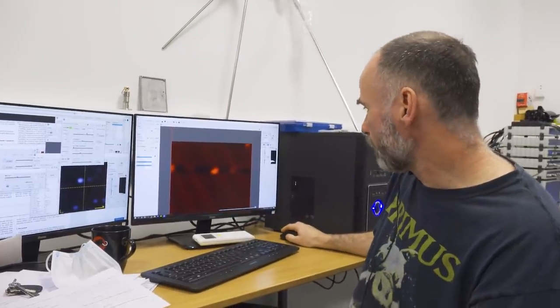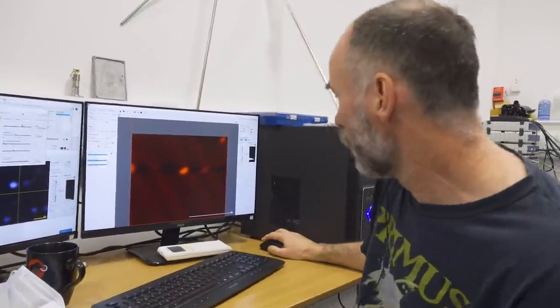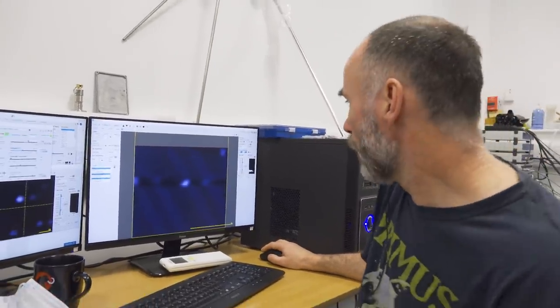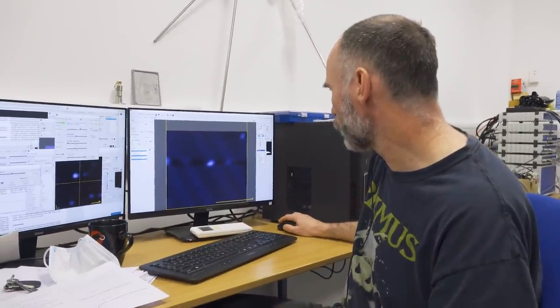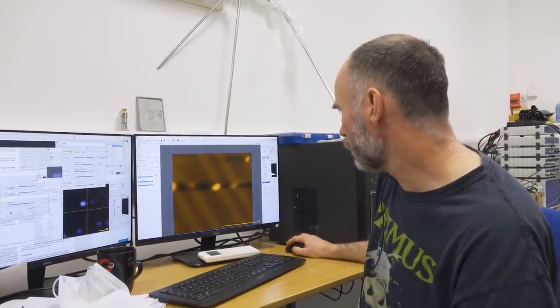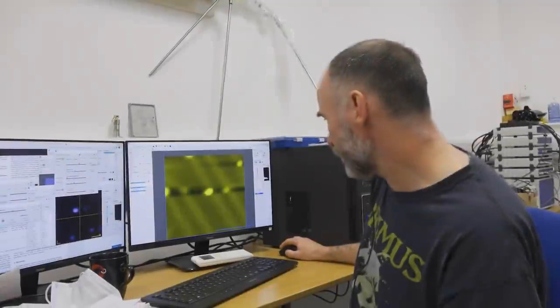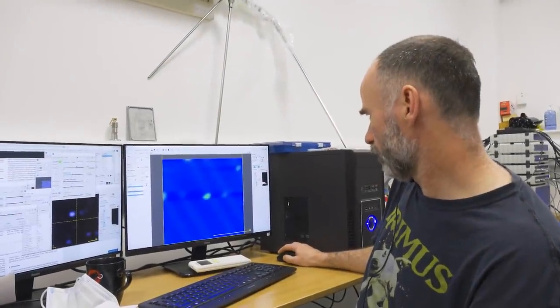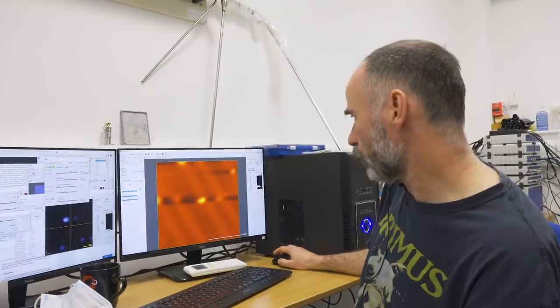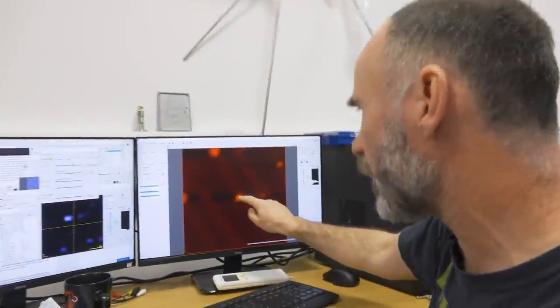So we can define whatever color scheme we like. At the moment, our atoms are sort of red, yellow. If you want them a bit blue, there they go. If you'd perhaps prefer to have them a bit coppery, like that, or maybe a slightly different goldy color. Does that look gold to you? It looks more green to me. Let's see what winter's like. Oh, winter's like that. And Philippe's put together his own palette, which is called the Good One, which looks red and yellow again.